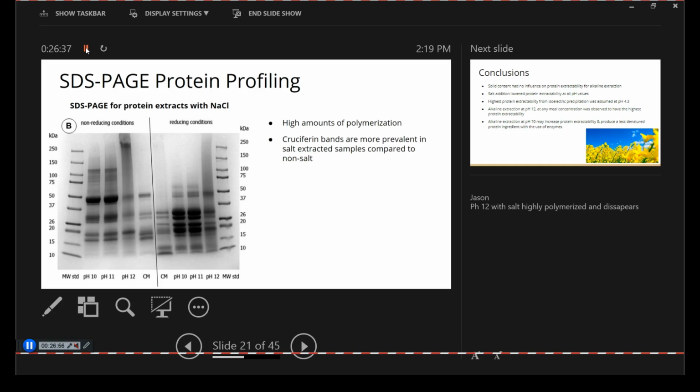Yes, so the enzyme that was used wasn't hydrolyzing the protein, it was hydrolyzing the pectin. However, with the lower molecular weight polysaccharides produced from that, there could be higher affinity for interaction between protein and polysaccharides, which could affect the results we saw as far as solubility and zeta potential. I think further investigation would have to be done to make that firm conclusion, though.